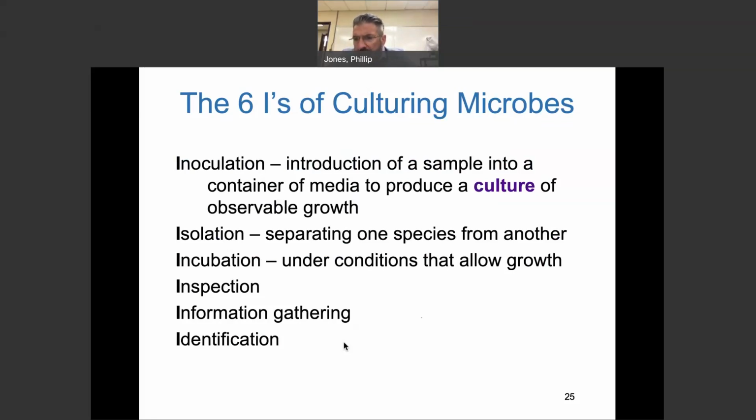We'll be doing a motility test where we'll stab some of these gel tubes, and then we'll see if things move perpendicular to the stab line. We'll say, well, that thing has flagella, it's propelling, it's moving away from the stab line. And we'll go over all this. We'll go into some citrate production, differentiating Pseudomonas, which grows on everything and anything.